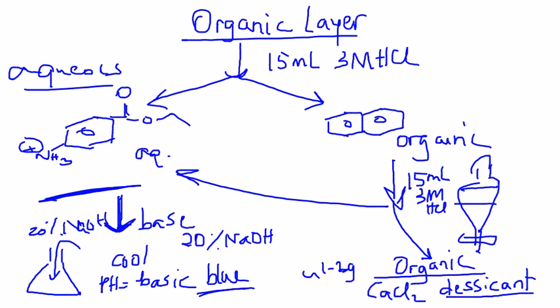So what you're going to do is keep it for about 5 to 10 minutes. And if you see that there is some additional calcium chloride which does move with the swirling motion, then that's good. If it's not there, then you probably have to add a little bit more to saturate the system with calcium chloride. And at that point, we will bring in a pre-weighed round bottom flask. So you must know the mass of that round bottom flask and record it in your observation table.